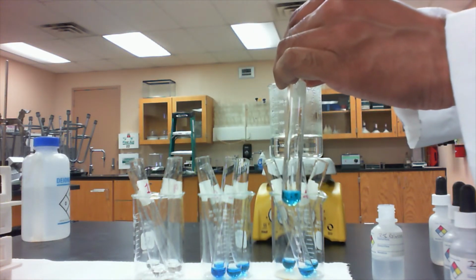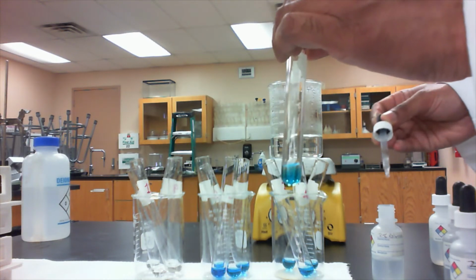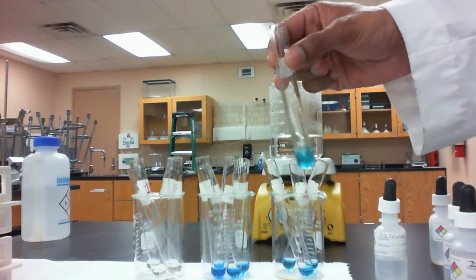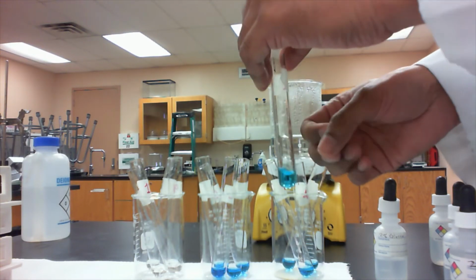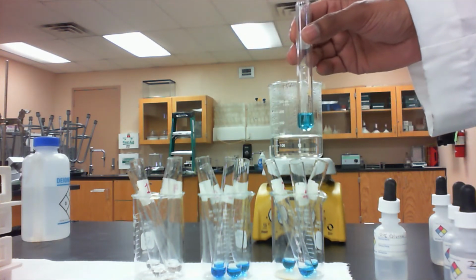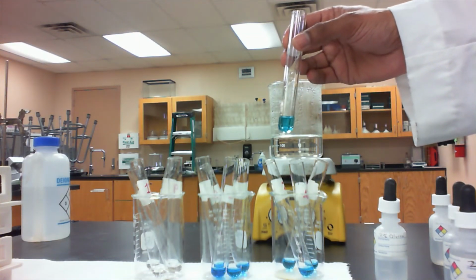So 1, 2, 3, 4, 5, 6, 7, 8, 9, 10. And when you add 2 things together in a test tube or in any container, it's a good idea to swirl as you mix it, or you can flick it at the base of the test tube to make sure that everything is mixed uniformly. So I'm going to repeat that process according to the instructions, and I'm going to add the corresponding sugar solution to the proper reagent.